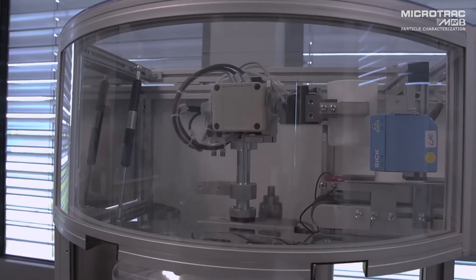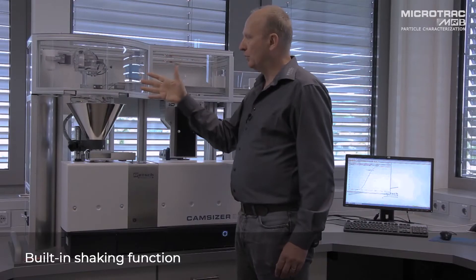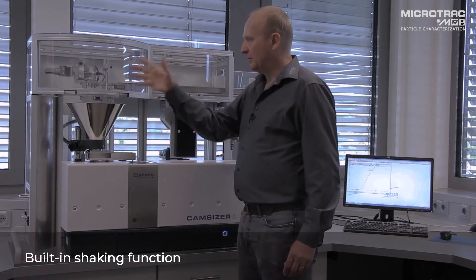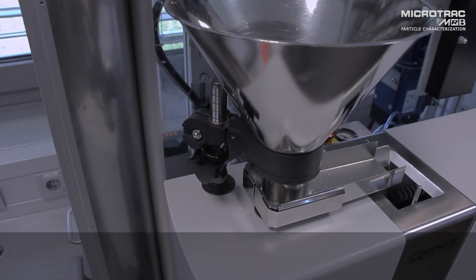As you can see the robotic arm picks up the sample, agitates the beaker to make sure the whole sample has been delivered, and then drops the beaker ready for reuse for the next sample.